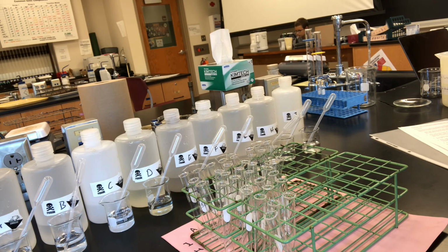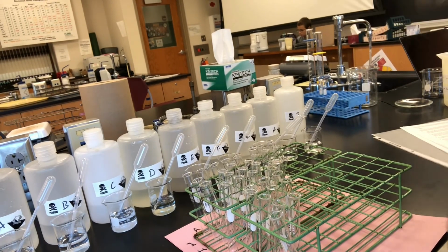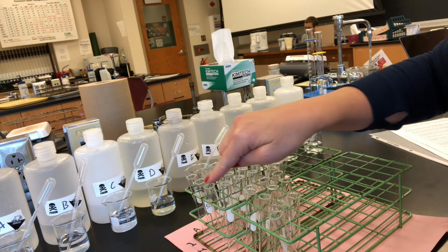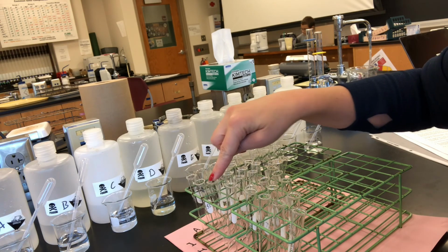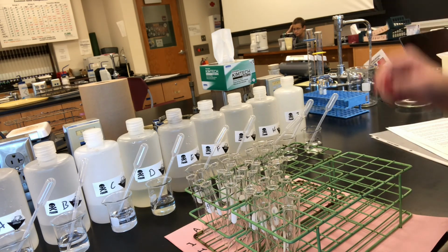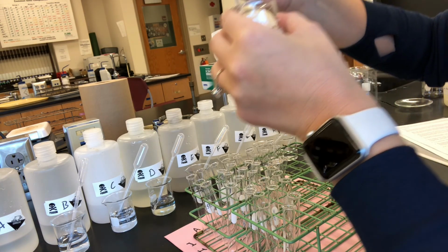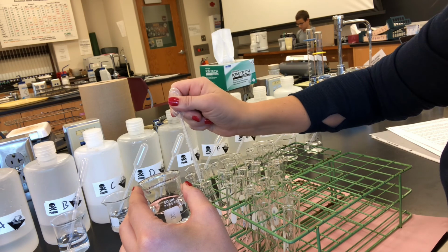All right, so let's get started. I'm going to take unknown A, and I'm going to add about half a milliliter, about 10 drops of unknown A down this entire first row here. And then I'll go through and add I, H, G, F, E, D, C, and B. Good thing I labeled it because I can't do the alphabet backwards, it turns out. Add about half a milliliter to each one of these test tubes.